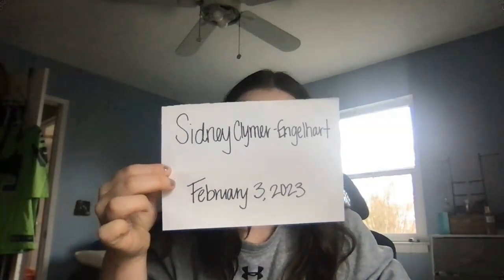It is February 3rd, 2023, and I will be talking about the different structures of the heart. The first four things I wanted to go over are the four different chambers of the heart. I cut the heart for the lab in a frontal plane so that you could see both the anterior and posterior sides of the heart. Right now I am showing you the posterior side.